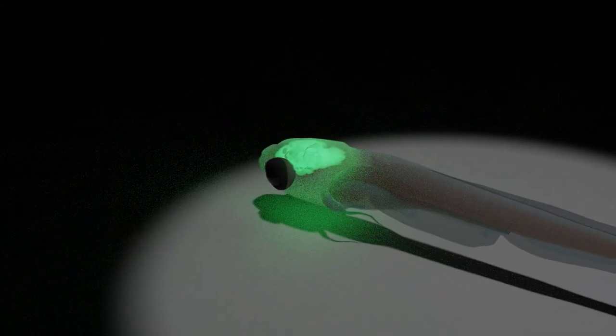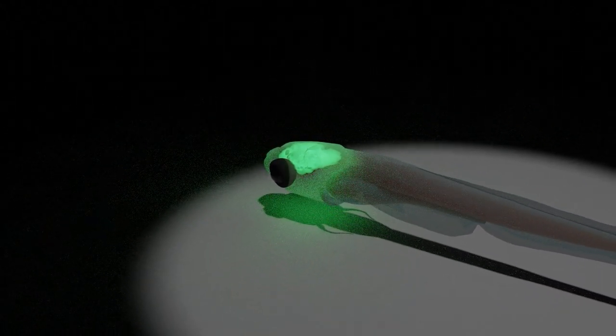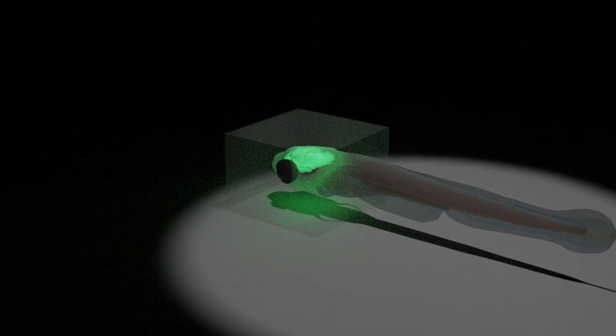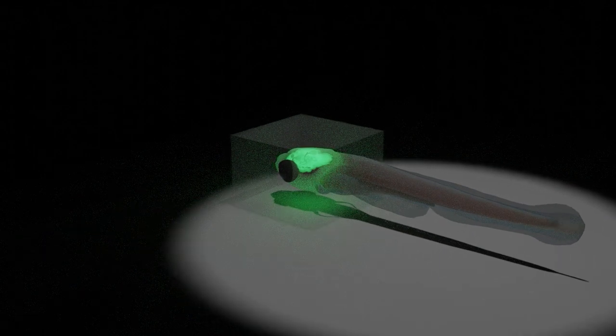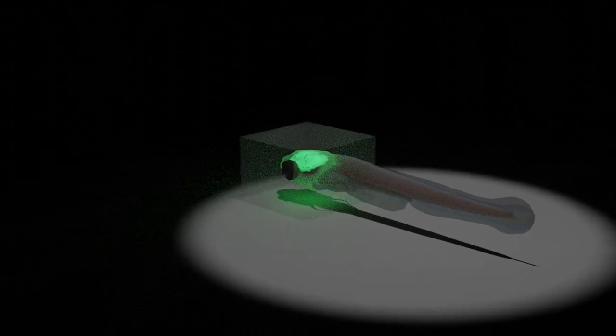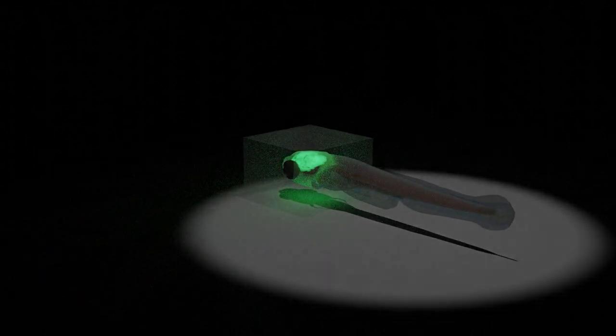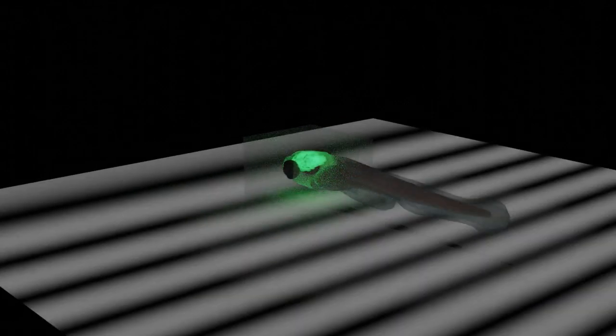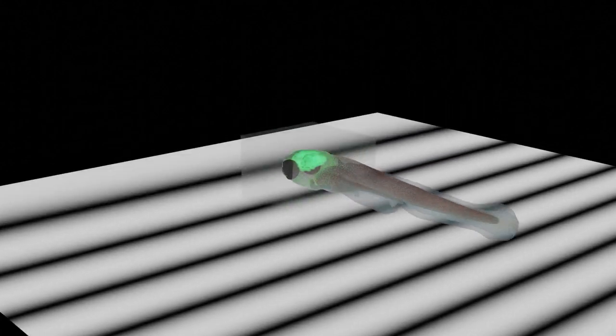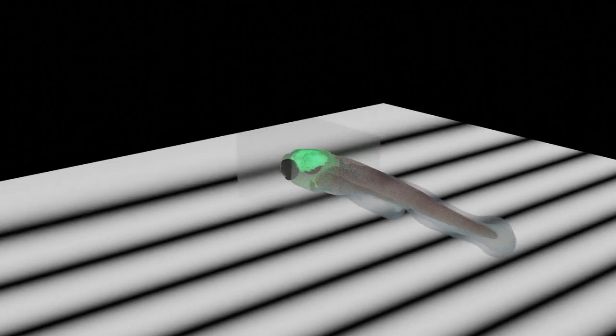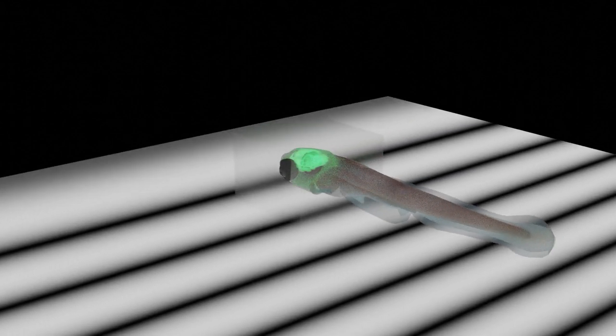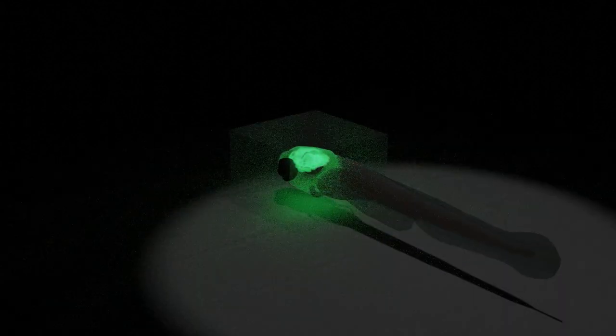For this purpose, we embed it in a transparent material called agarose, and we project stimuli from below. In this case, the stimulus is a moving background that elicits forward swimming in the fish.